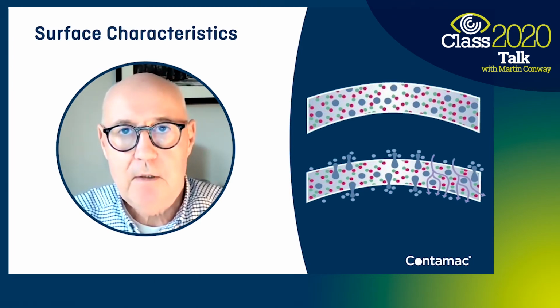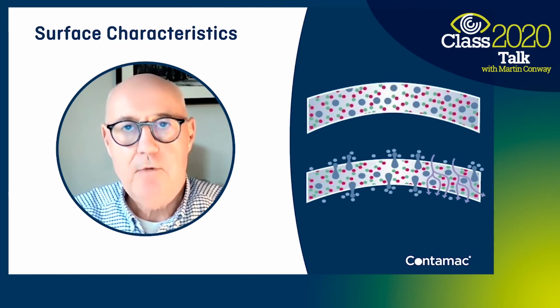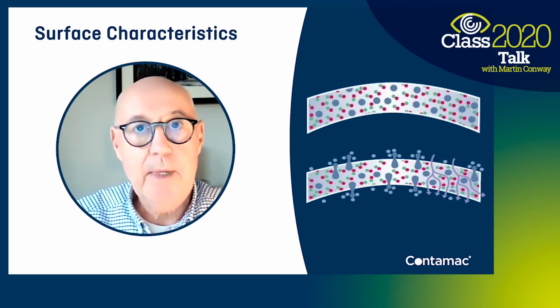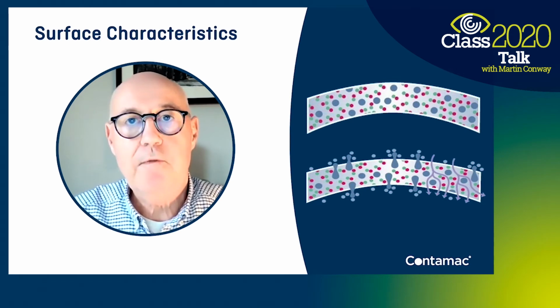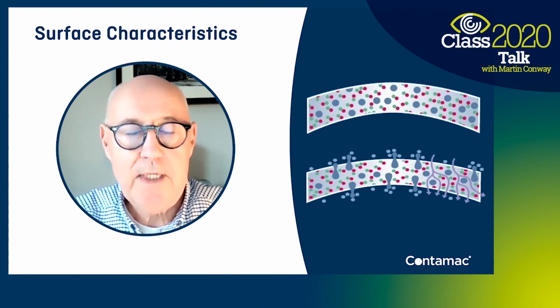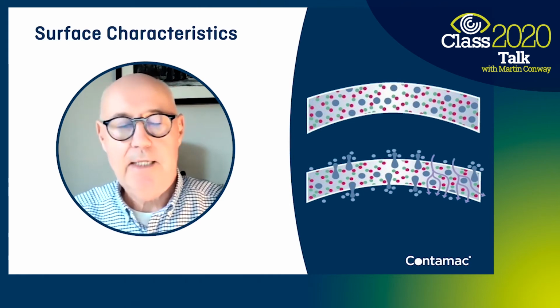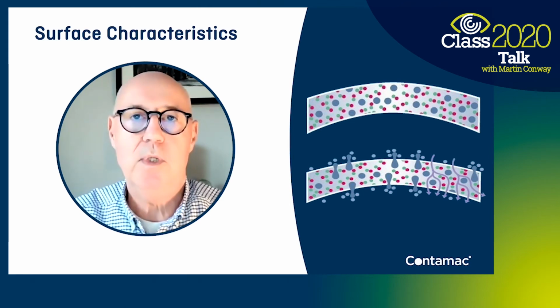And if that material is now soaked in a liquid, the hydrophobic parts of the matrix will turn away from the surface, and the hydrophilic parts will be attracted to the surface. Now, this process can take up to 7 days or more, and that's why we always take two measurements, a soaked and a dry measurement. And there is quite a huge difference in the measurements we obtain.